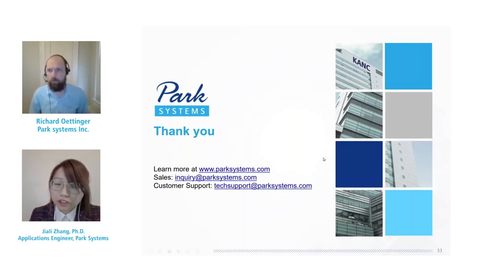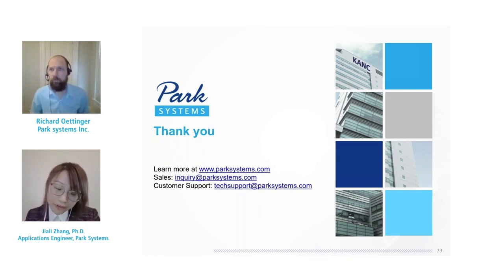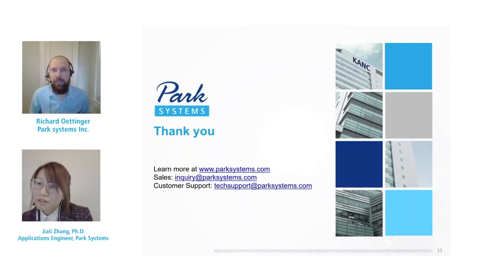Okay, so in general, the tip radius can be quantified with SEM, but in our systems, you can get all the radius and specifications in SmartScan software, and also we have all the specifications in the spec sheets when you purchase our tips from our company.